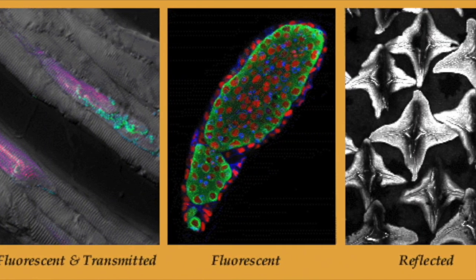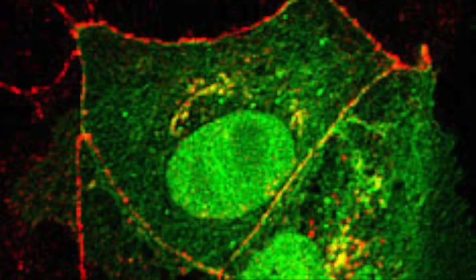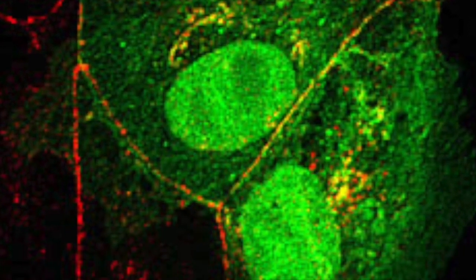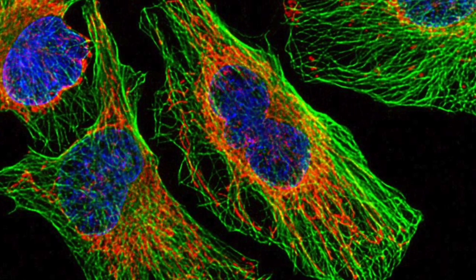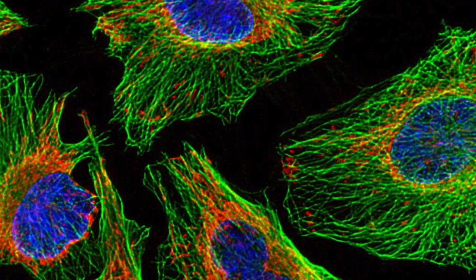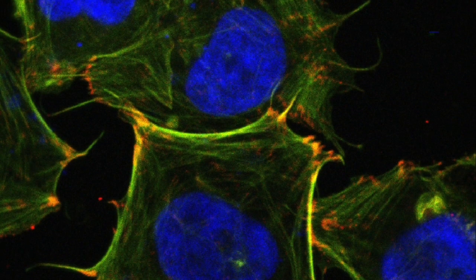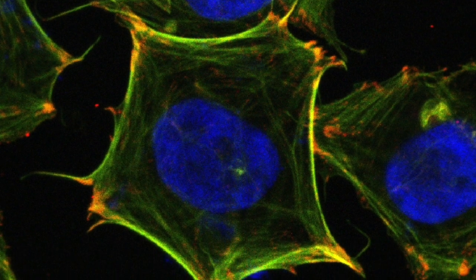The confocal microscope was invented in 1955 by Marvin Minsky. The confocal microscope uses laser light to scan samples that have been dyed. This is very different from a light microscope for image formation. The samples are dyed, prepared in slides, and inserted. Then, with the aid of a dichromatic mirror, the microscope produces a magnified image on a computer screen.